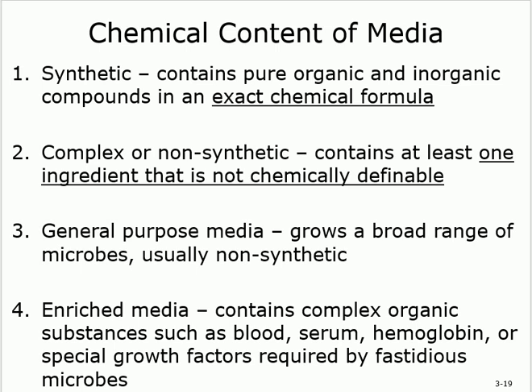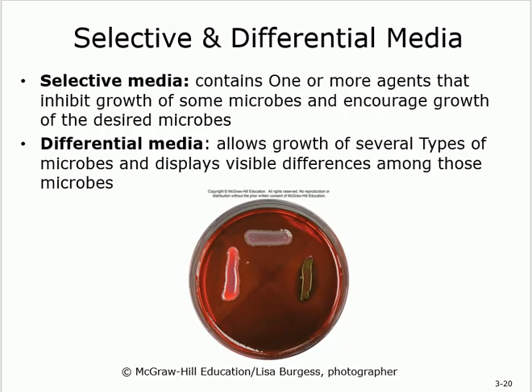They get it from different sources, but at the end, high nutritional value, and you add growth factors to it. Is that clear? When do we need the enriched media? If you need to grow something very fast. You have an hour and tell me exactly what kind of organism do we have here, or the patient will die, for example.